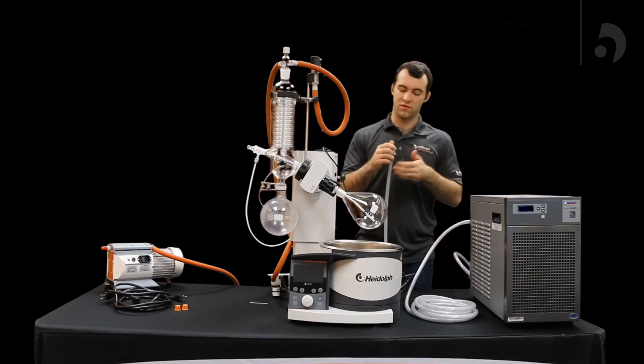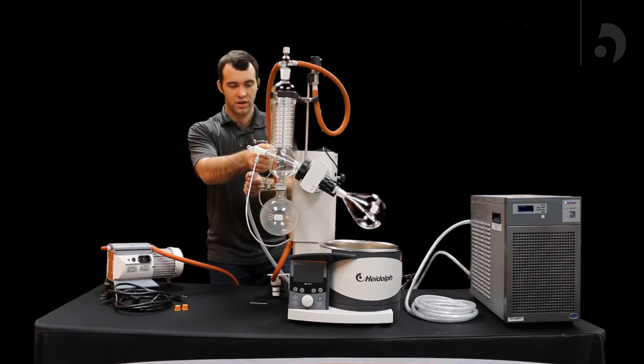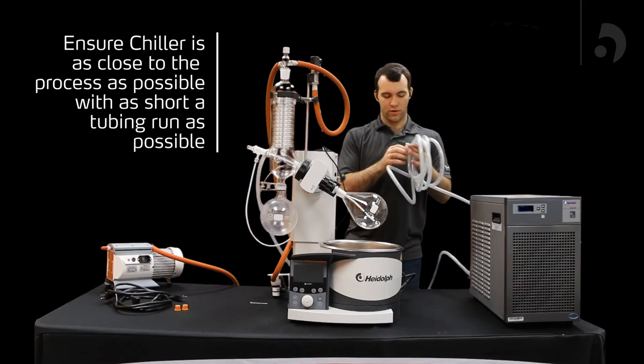Once you've got that done, there will be two ports on the back of your condenser. Screw one of them into the other. It doesn't particularly matter, at least with the G3 model. And the other hose into the other side.